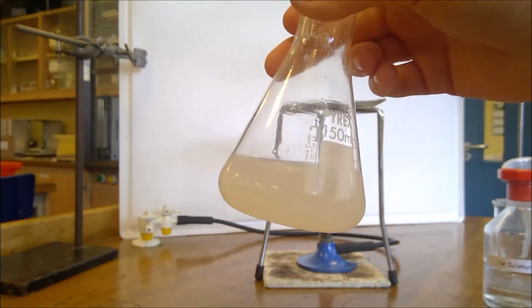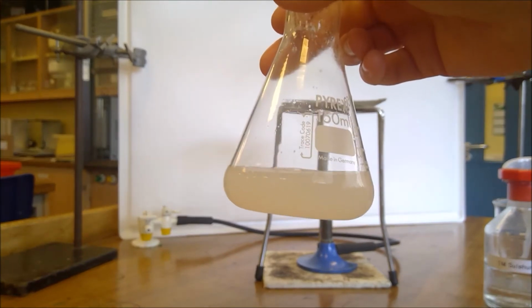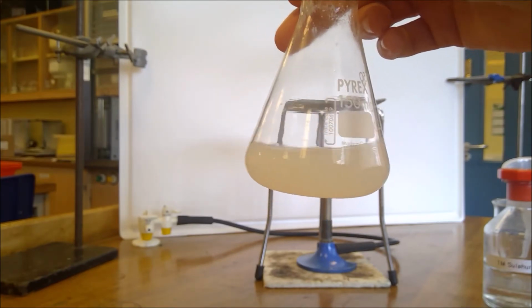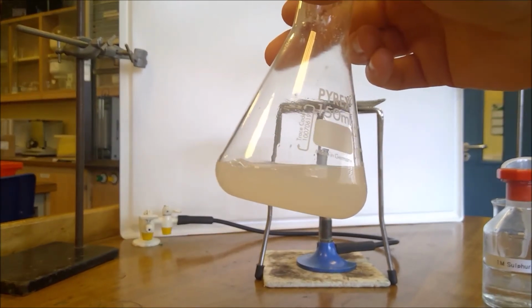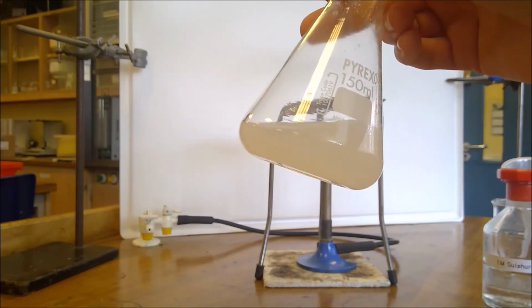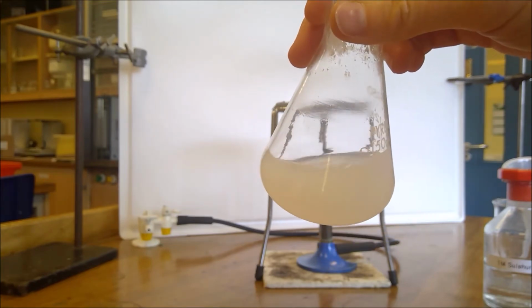So remember that our magnesium carbonate was insoluble. So we kept adding it and it reacted with our acid, and we heard and saw the effervescence there. But once we got to the point where all of our acid had been neutralised, any more carbonate that we added would just stay. It would not react away. So the cloudiness here is formed by the unreacted magnesium carbonate that we've put in.